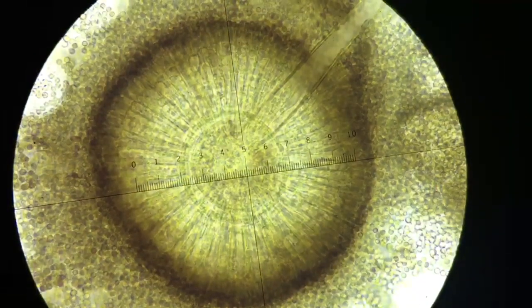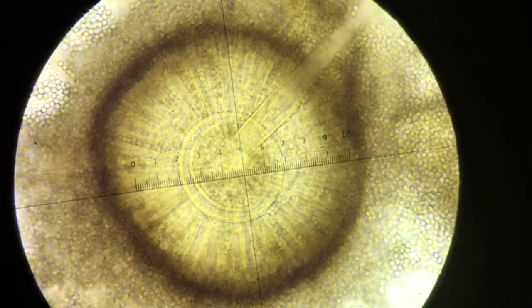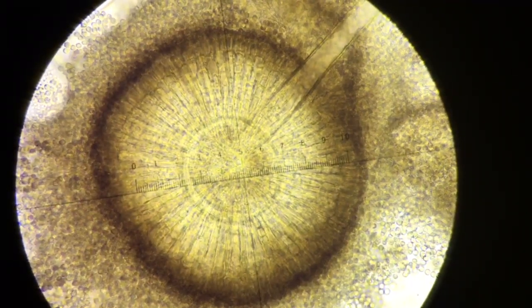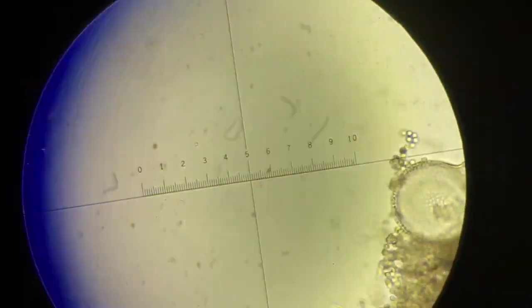If you let these live long enough, they will produce very large clusters of spores that appear more and more irregular on the macro scale. So we can see here, and I will have sections where I zoom in even more to show more details.